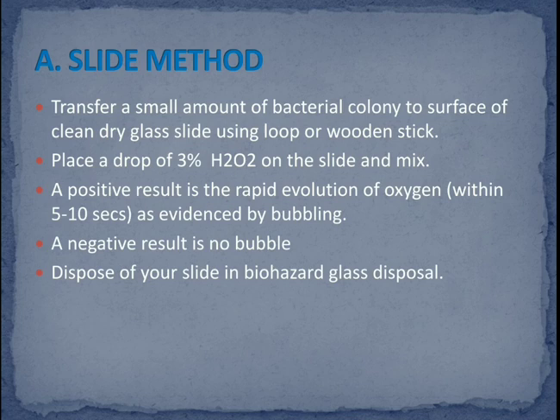A positive result is the rapid evolution of oxygen within 5 to 10 seconds, as evidenced by bubbling. The 5 to 10 second time should be observed very carefully. A negative result is no bubble. After the test is finished, dispose of your slide in a biohazard glass disposal.